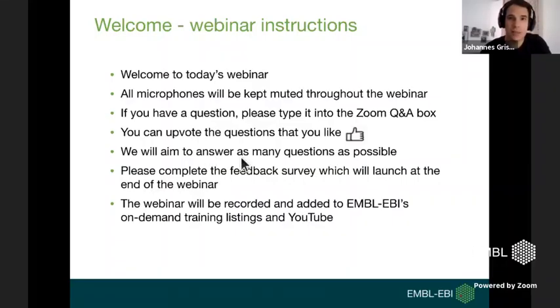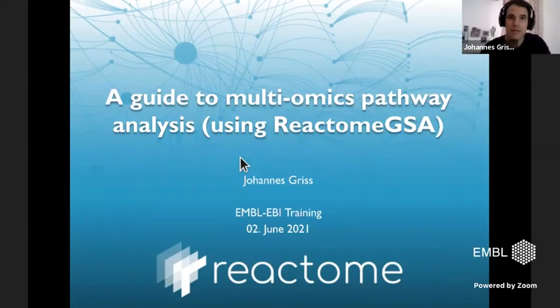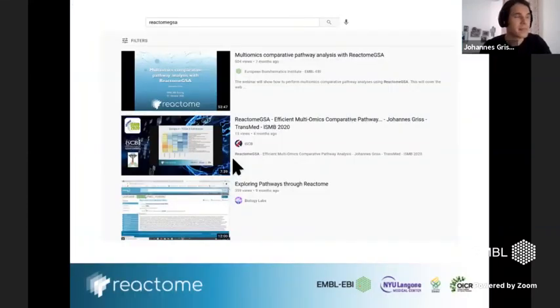Today's training webinar, I'm going to give you an introduction into multi-omics pathway analysis, focusing on our tool that is specific to this problem, called ReactomeGSA. As mentioned by Anna before, this training is recorded and put on YouTube later on. And as you can see, this is just a YouTube search from today.